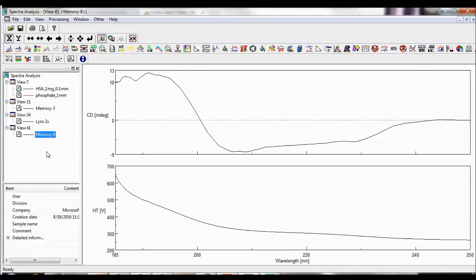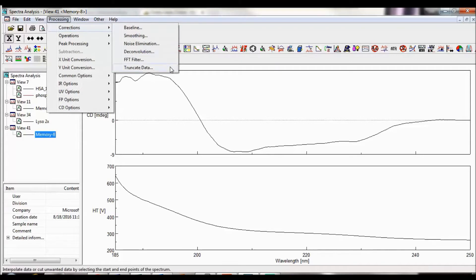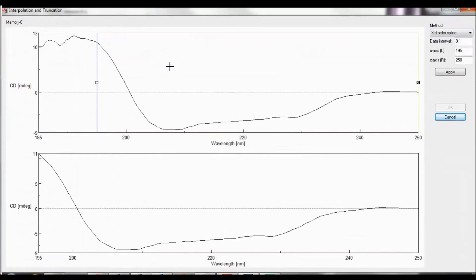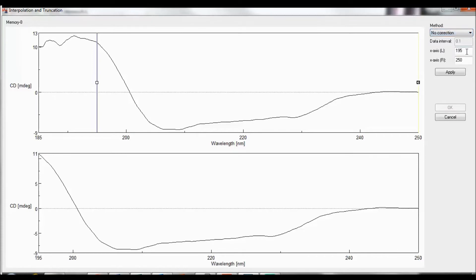To cut a spectrum to a specified wavelength range, select Processing, Corrections, Truncate Data. This function allows you to cut a spectrum without changing the data point interval. The original spectrum is displayed at the top of the spectrum display area, while the truncated data will be displayed below the original. To only truncate your data, select No Correction under the Method drop-down list. Then specify the wavelength range you wish to create. Click Apply and then click OK to execute the truncate function and create a new memory.